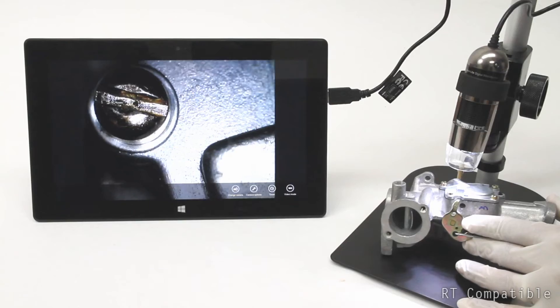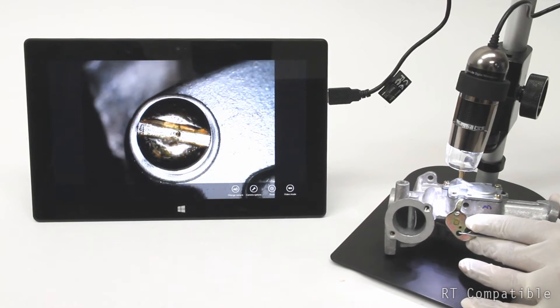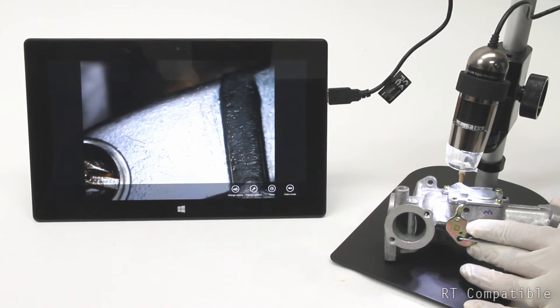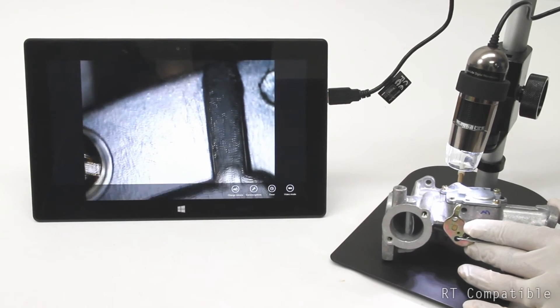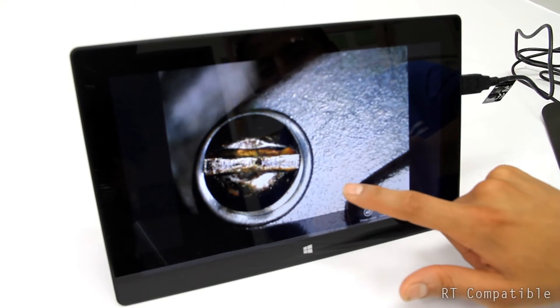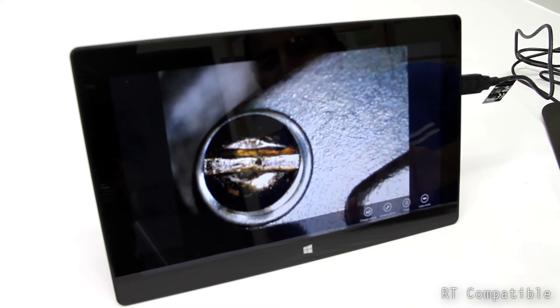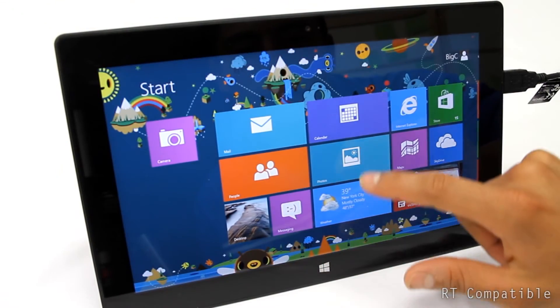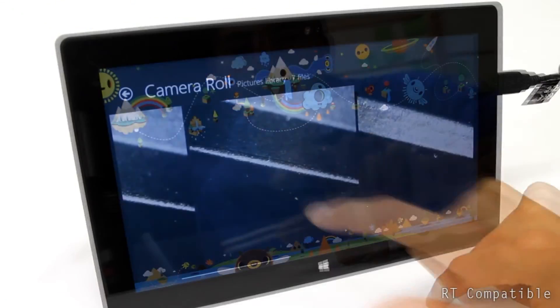Open the camera app and switch to the Dynolite camera for instant use. Press on the screen to capture an image, and the images will be in your normal camera roll.